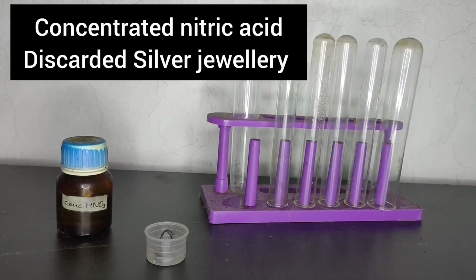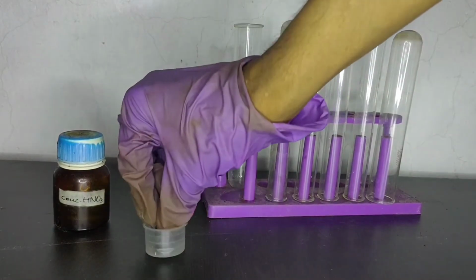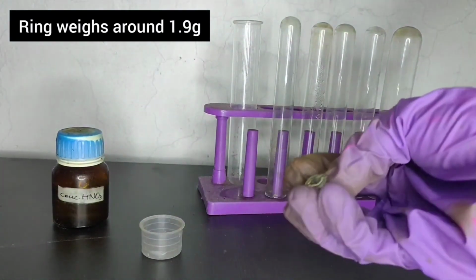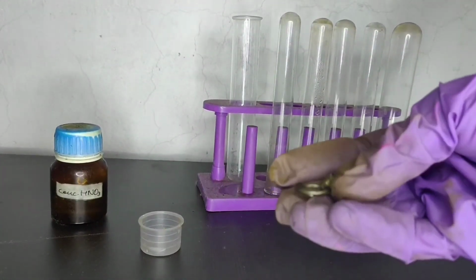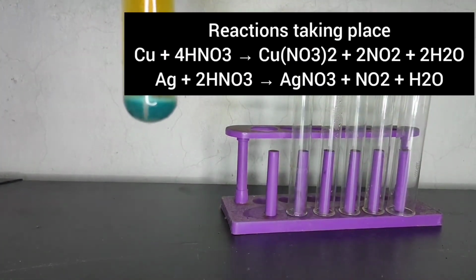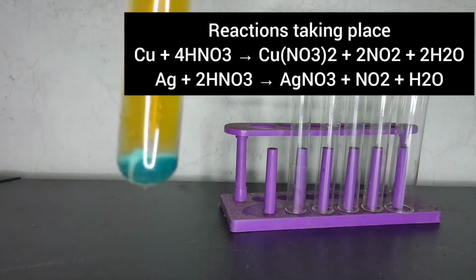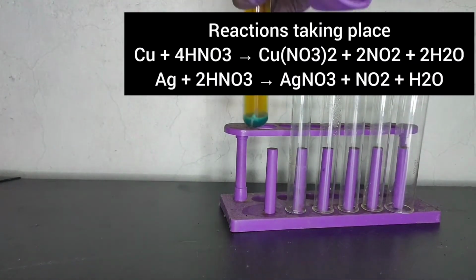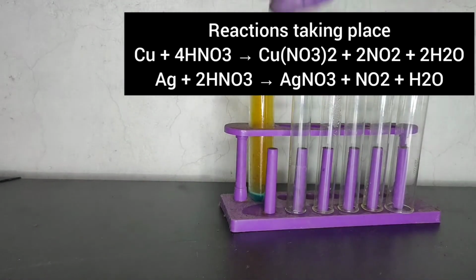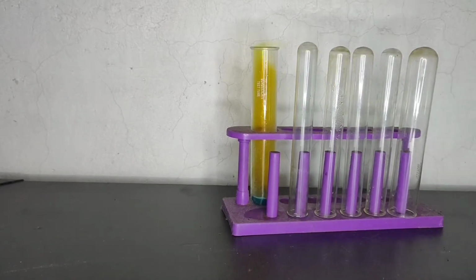So in this video, I'll be making some silver nitrate from an old toe ring which weighs around 1.9 grams. First, we have to extract pure silver from it. So I added 3 milliliters of concentrated nitric acid to the toe ring. You can see evolution of brown fumes takes place due to nitrogen dioxide, and the solution turned blue due to the presence of copper.